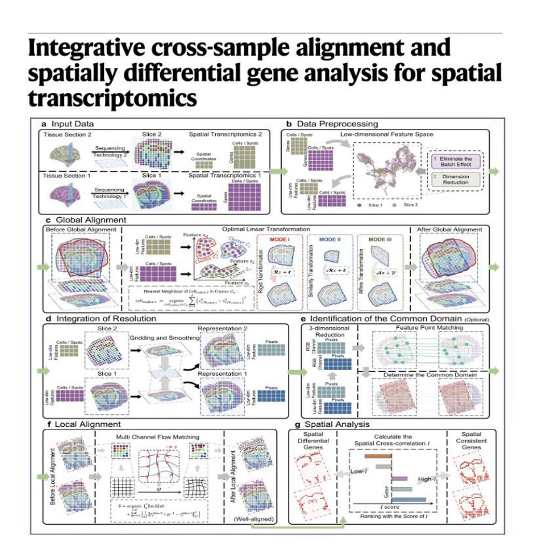When tissue is cut and placed on a slide, it rarely stretches evenly in all directions. It shears and skews along specific axes. Oh, because of how it's physically handled in the lab. Yeah. The affine mode mathematically reverses that specific directional silly putty stretch so the global shapes match up again.